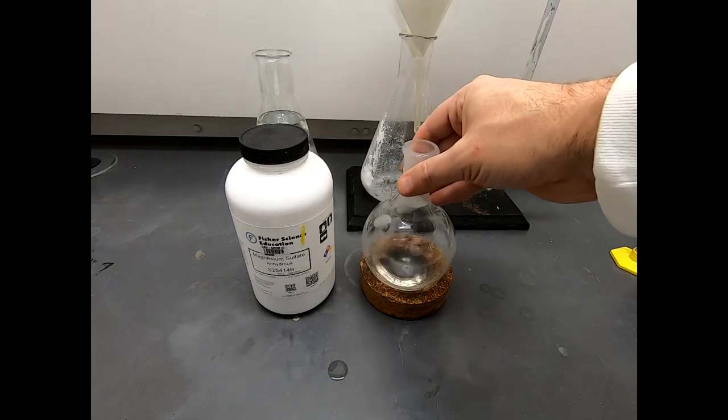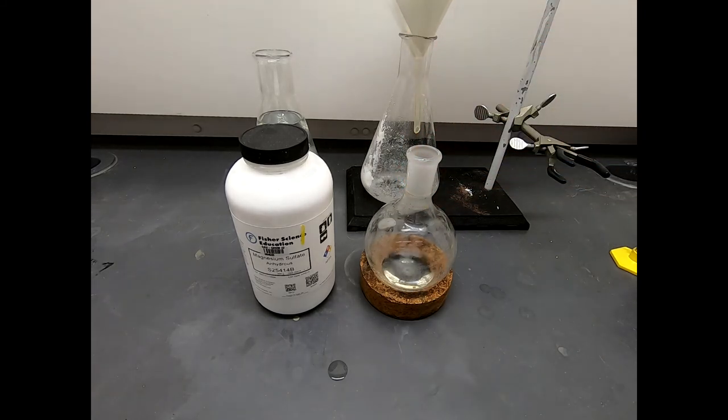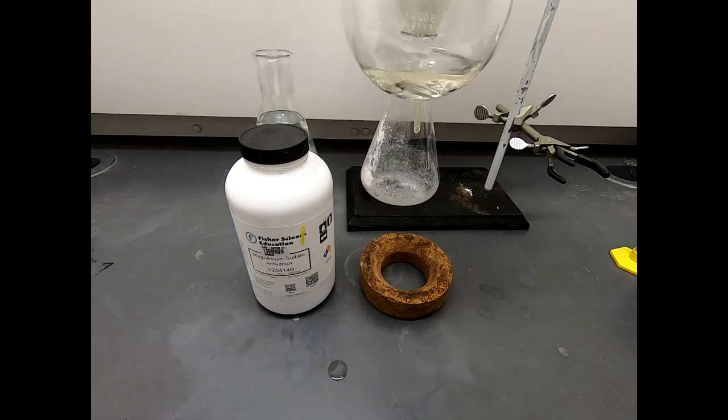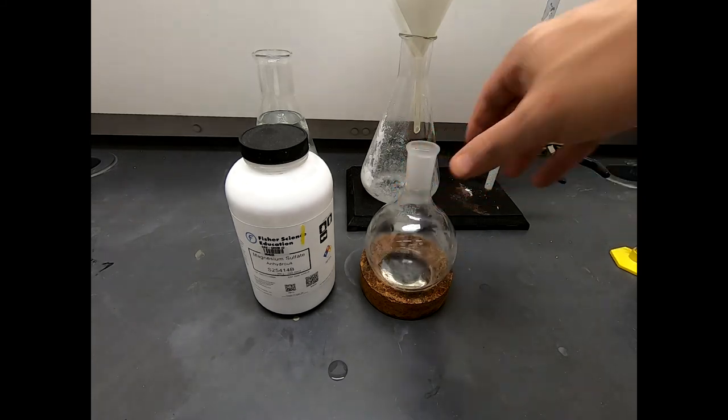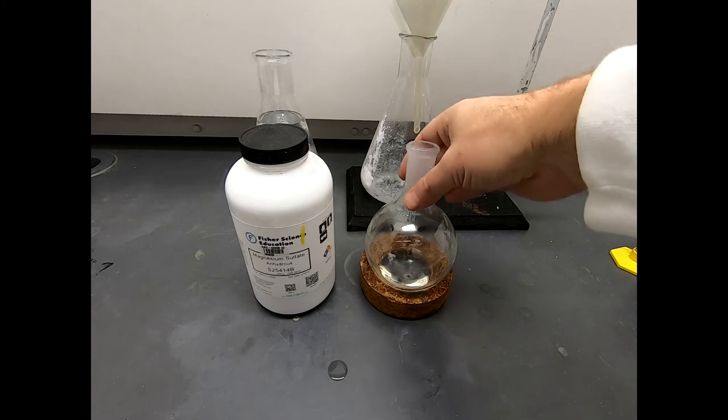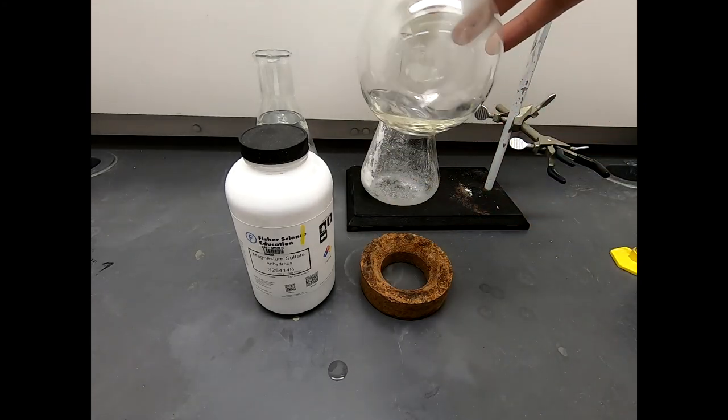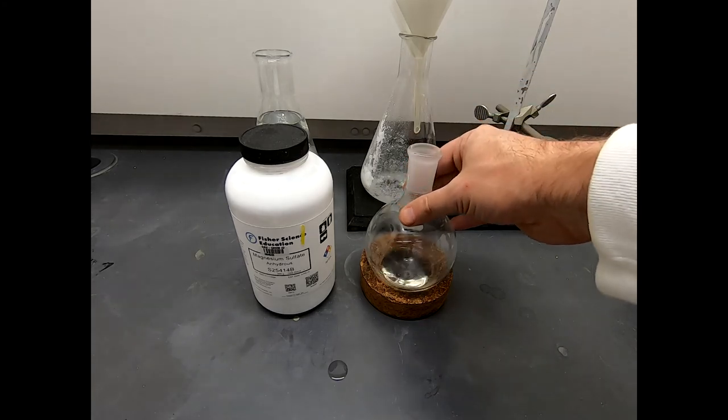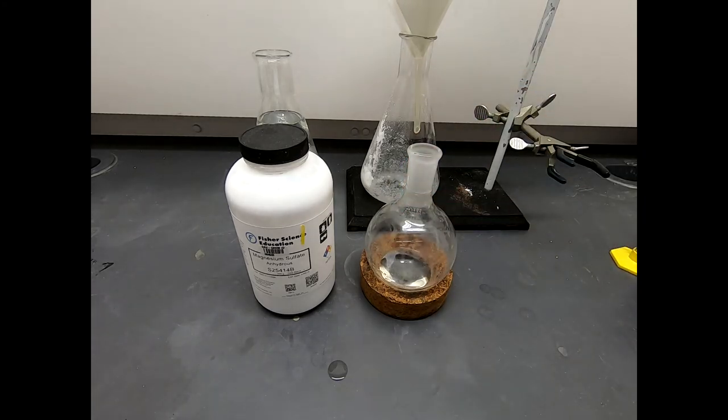And an NMR will tell us everything we need. And if we wanted to be more thorough, we could do things like look at it by GC and that sort of thing. But NMR will answer us just fine. My only concern is that we have a lot of ether left in here. I don't think we do, but that is probably my biggest concern. So we'll get an NMR of this material and see what we have.